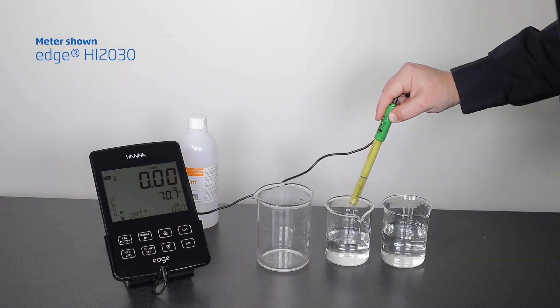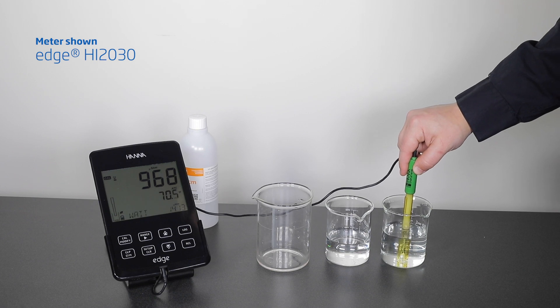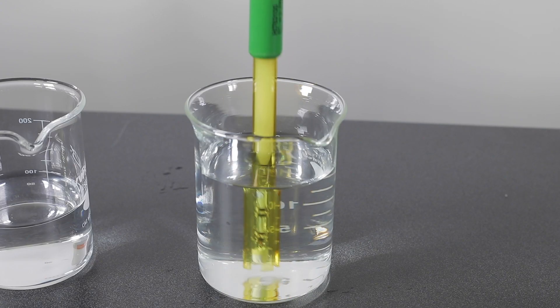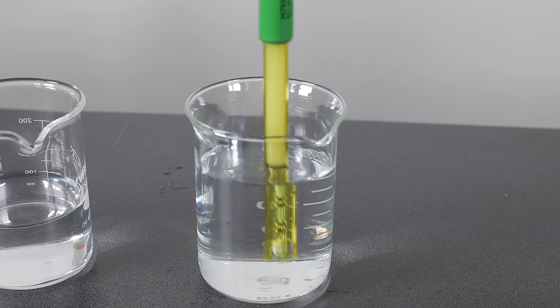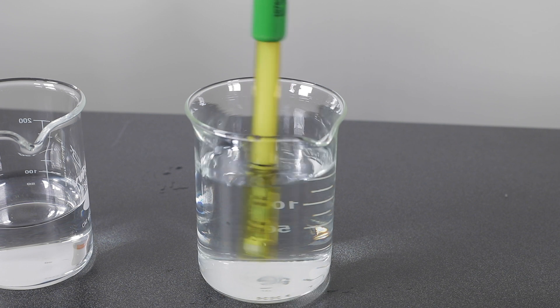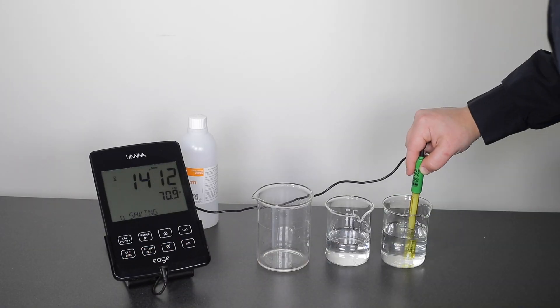Next, you can calibrate the probe in your standard. Immerse the probe in your standard and gently tap the probe on the bottom of the beaker. This removes any trapped air bubbles. Gently stir the solution. You don't want to introduce extra air bubbles into the standard. Wait for the probe to stabilize and continue on to measurement.